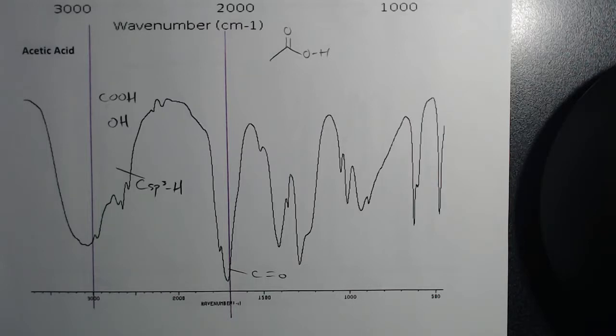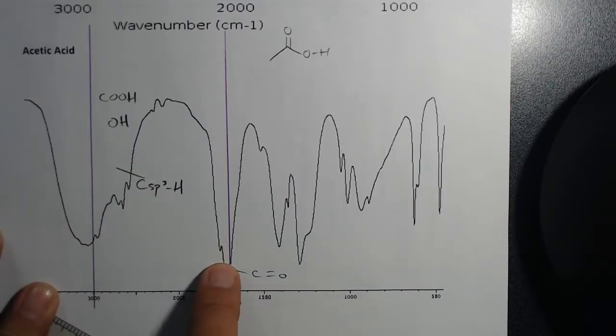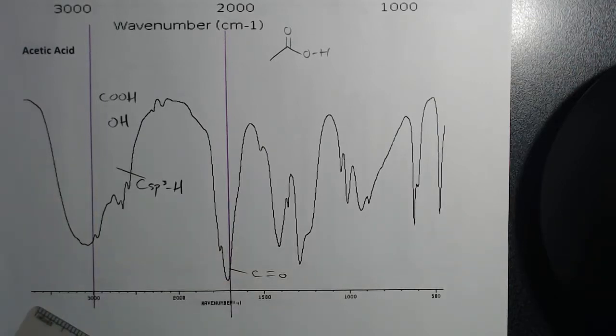Another tell that it's a carboxylic acid OH is that the carbonyl broadens also a lot of the time. So basically your OH stretch is broadening and your carbonyl is broadening. The main reason why you're getting additional broadening here is because it can have more hydrogen bonding than a regular OH does. We're going to see it next semester, but the two oxygens that are involved in the carboxylic acid are constantly playing hot potato with that H. They're constantly just, hey, you can have it now. Oh, you can have it now. They constantly bounce back and forth. And because it's not stationary, the OH broadens in the spectra. It's having more hydrogen bonding possible.